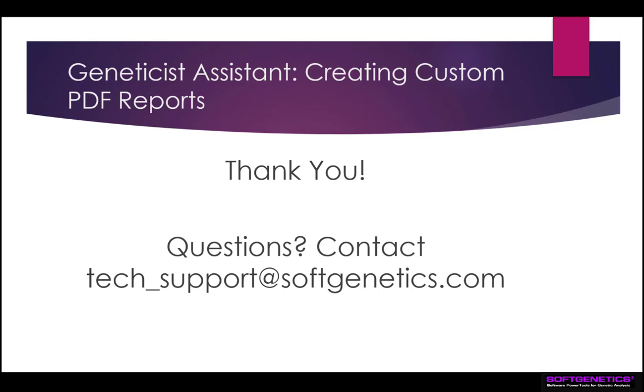Thank you for viewing this webinar on creating custom PDF reports in Geneticist Assistant. We've discussed how to build and save your custom template and how to save reports using this template.